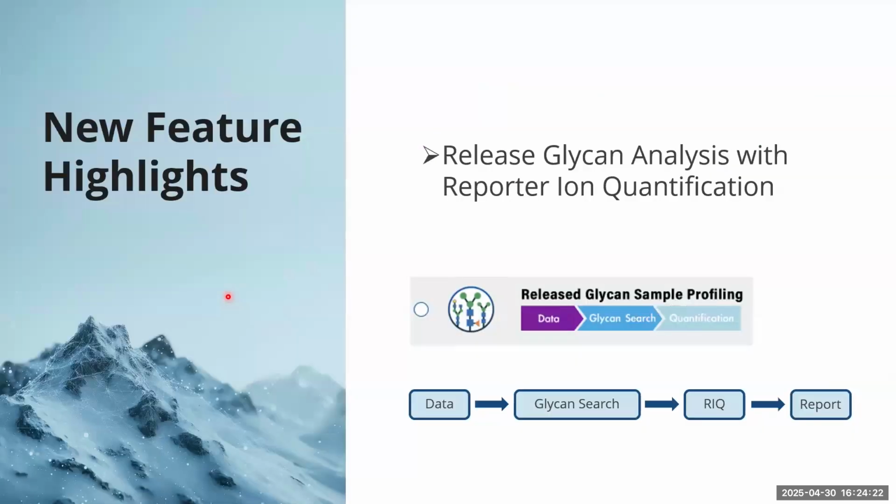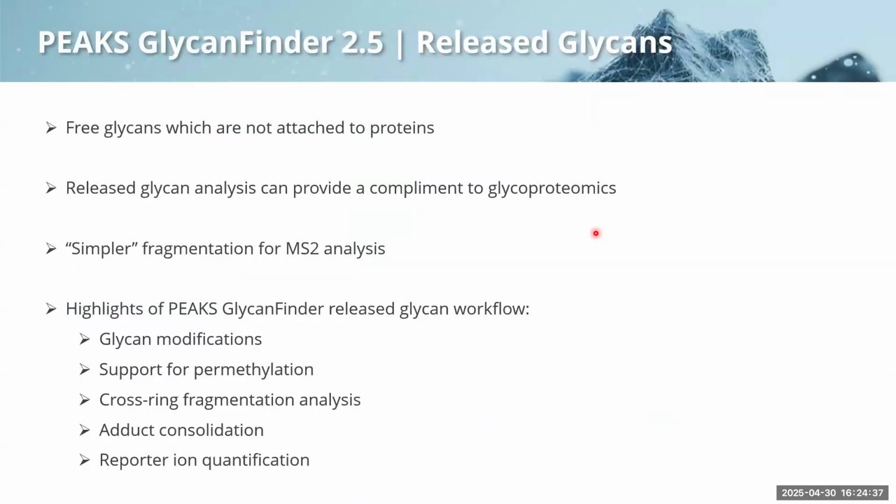So now I'm going to move on to discuss some of our new feature highlights. First, I'll be going over the release glycan analysis workflow with the reporter ion quantification. Just as an overview, free glycans, which aren't attached to proteins, are how we describe release glycans.